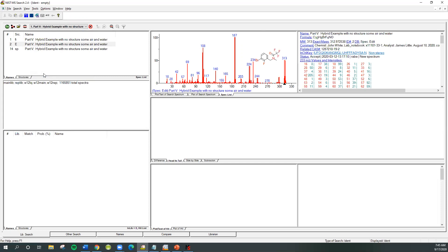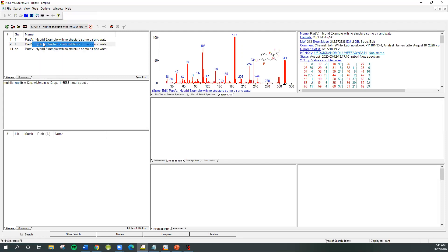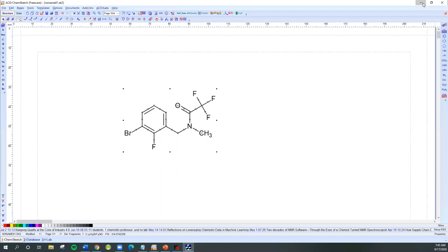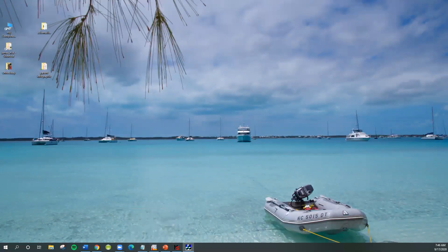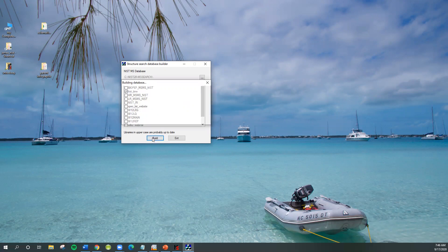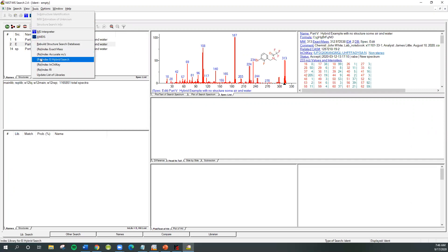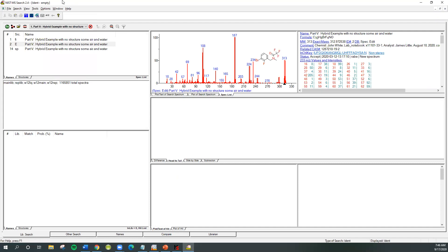It's been added to our library called 'first time.' The only thing is you have to recreate the indices. If you don't exit the program, it will not know about this new library, so go up to Options > Tools and say 'Update the List of Libraries.' That will automatically bring in the library name. The other way is to exit the program and come back in. If you want to do a structure search of your library, you'll need to create the structure indices by choosing 'Rebuild.' You may also want to update the hybrid search index and the InChIKey index, and if you added retention indices you can update those as well. Now it's pretty much ready to be used, searched, and shared with others.